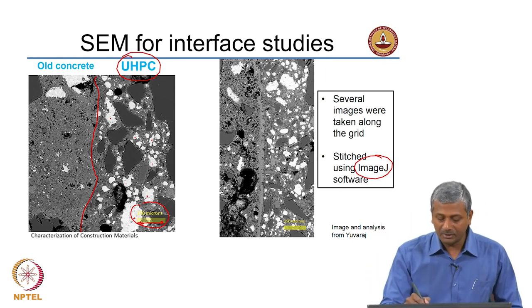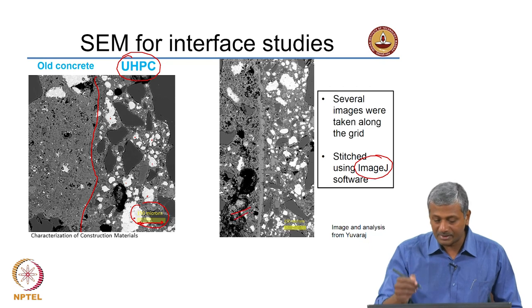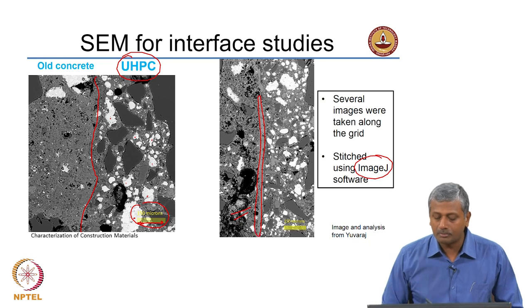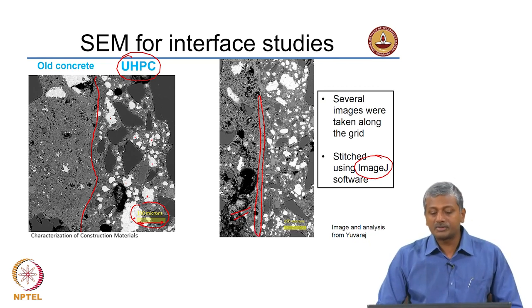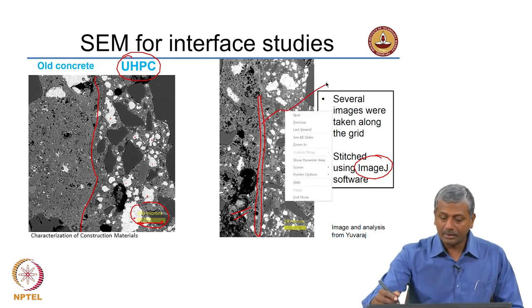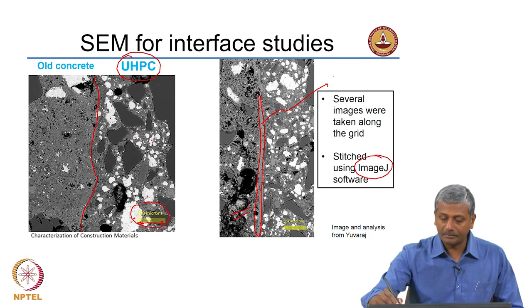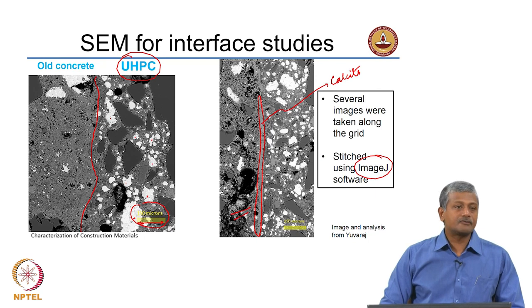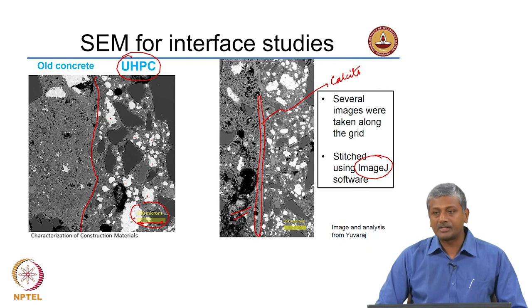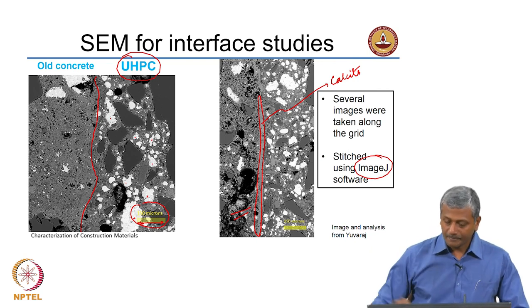In another example of the UHPC-old concrete interface, you can see a white or whitish layer formed on the surface of the old concrete to which the UHPC is actually bonded. That whitish layer is basically calcium carbonate or calcite, formed due to carbonation — old concrete lying outside in the atmosphere has atmospheric CO2 entering and leading to the formation of a calcium carbonate layer on the surface.